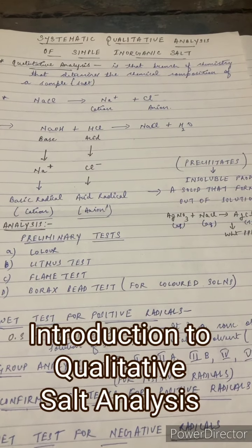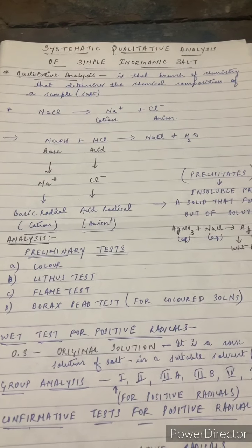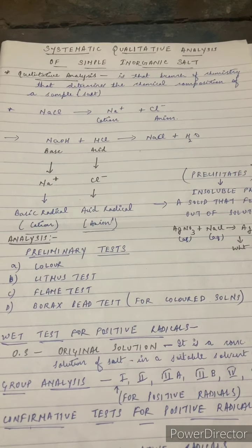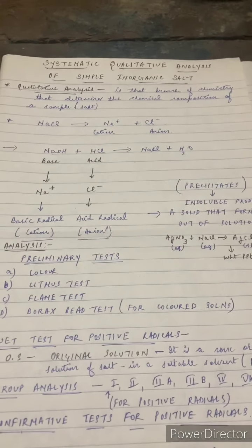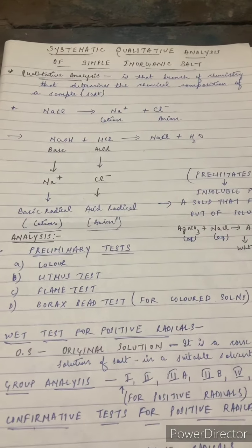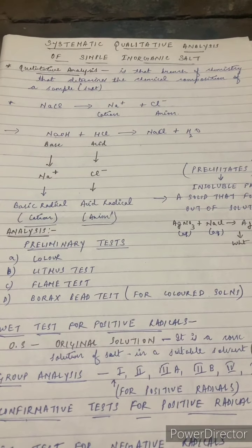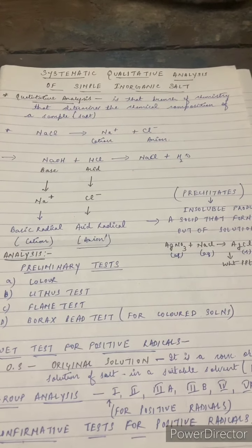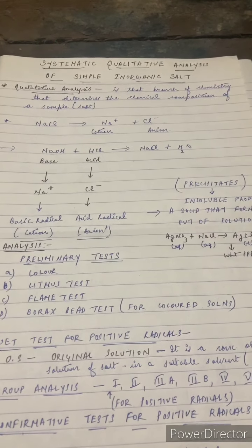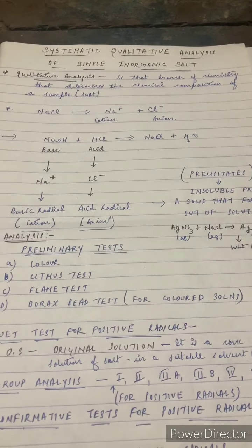Good morning everyone. Today we are going to perform qualitative analysis of an inorganic salt. Now in our previous semester we had done the quantitative analysis where we had determined the concentration of an acid or of a base. Okay, but now in this semester we are going to analyze the salt solution qualitatively.